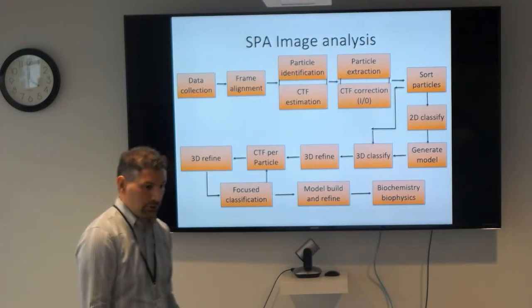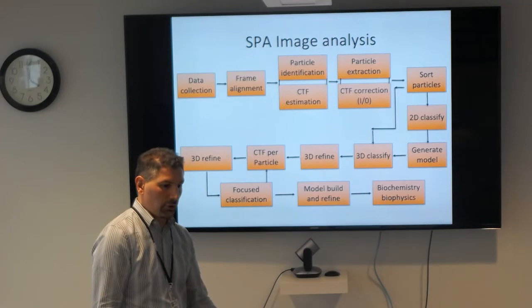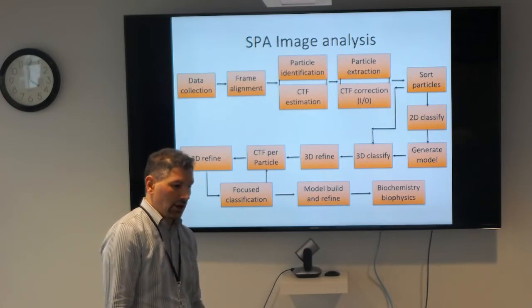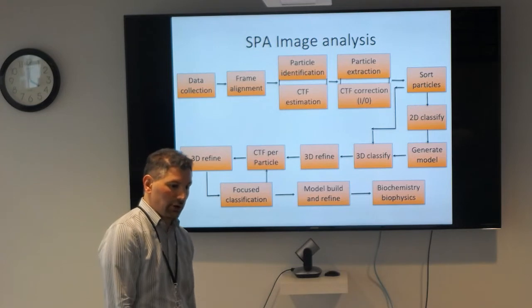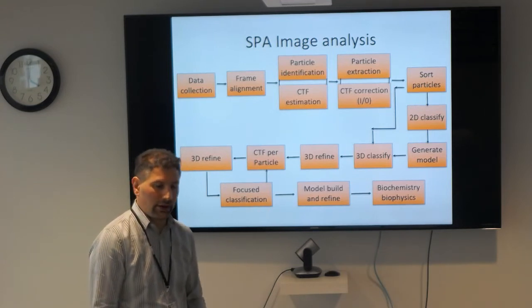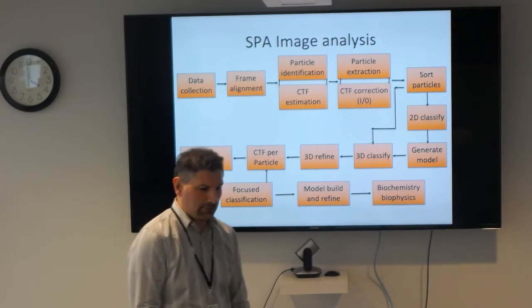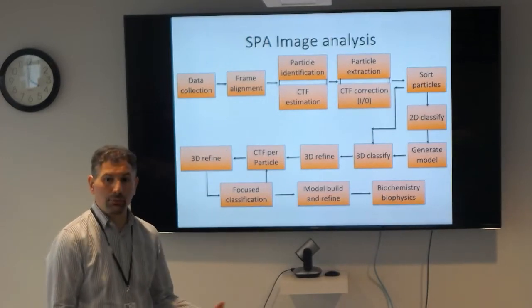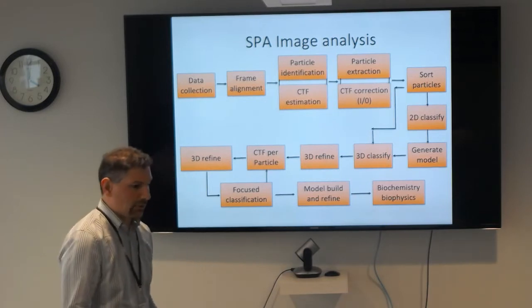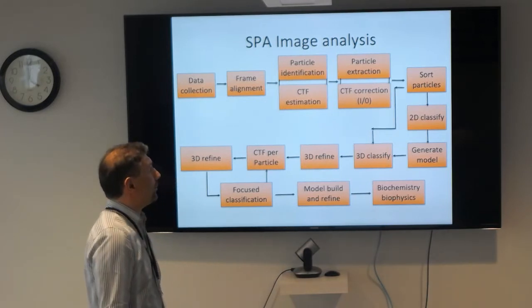There's plenty of GPUs. Some people like to throw out the first frame because they say that causes the most drift. Others would argue, well, that's where the majority of your high frequency signal is, so why would you want to throw out the first frame? You can keep all the frames and you can play with it however you want. There's also movie mode in Relion, where you can play around with the different strategies to improve your reconstruction.